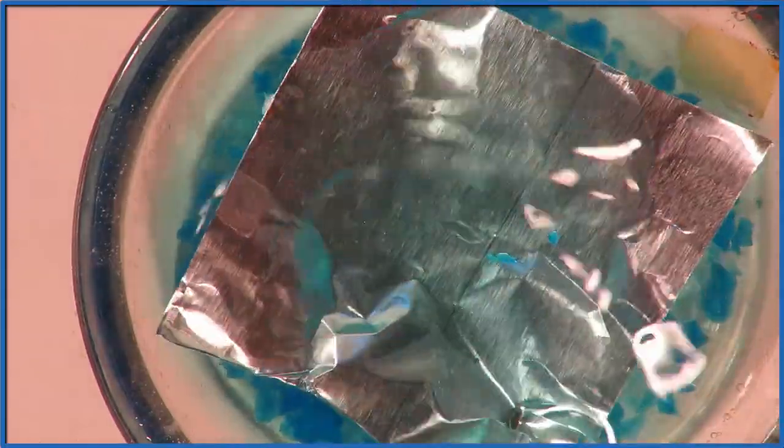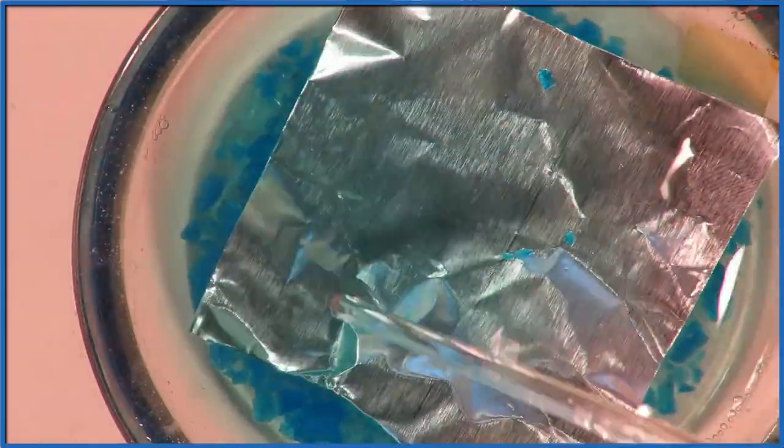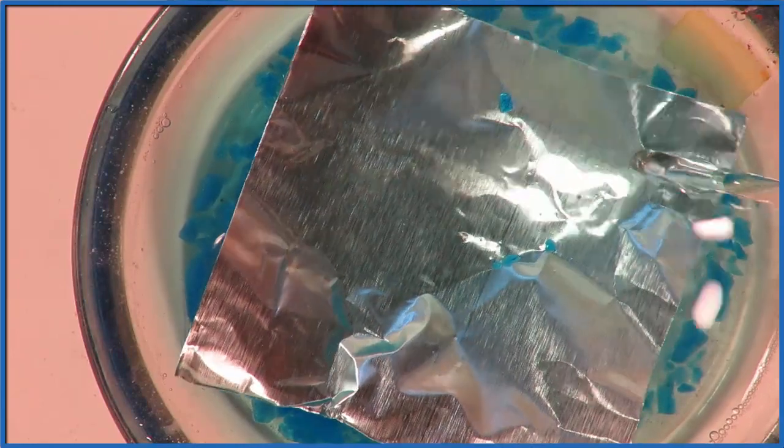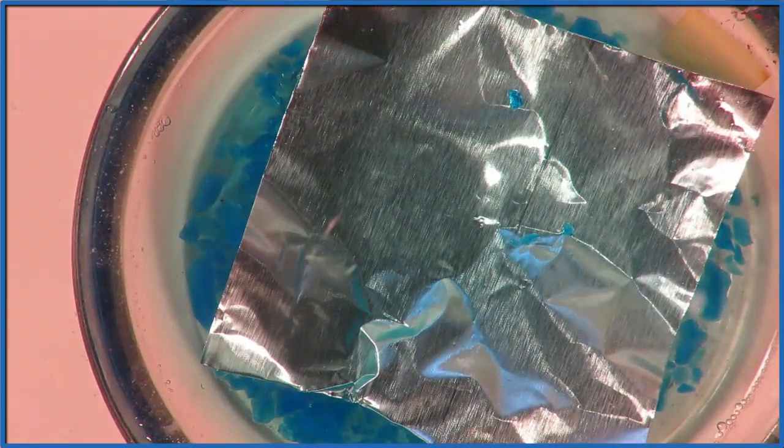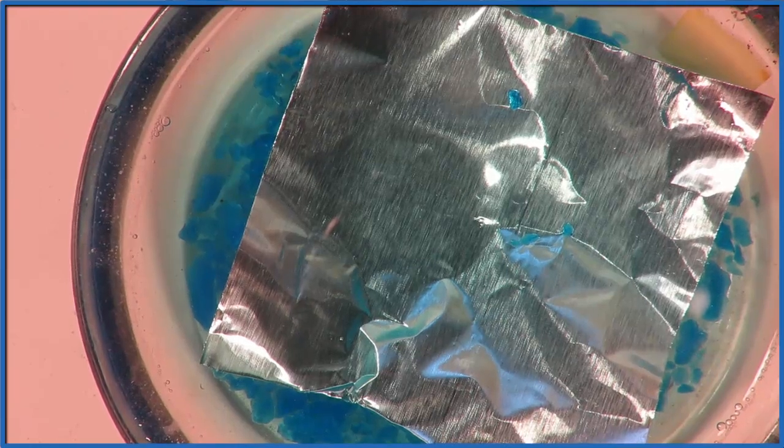Essentially, we're putting the aluminum into that solution of copper sulfate, and we should see a reaction where the aluminum dissolves and the copper — the blue — comes out and we see copper. However, we don't see anything, and in fact if we wait a while we'll start to see a little bit, but not much happens.